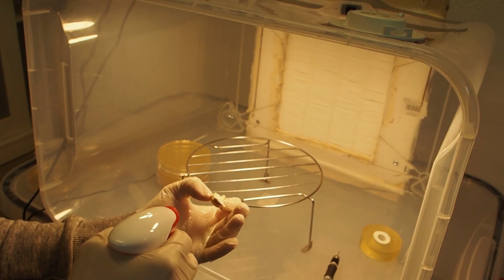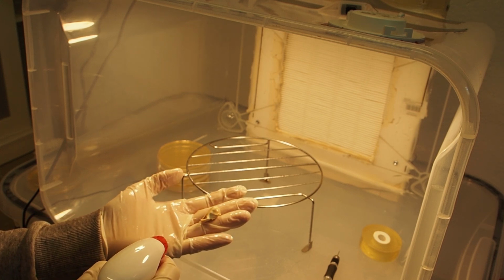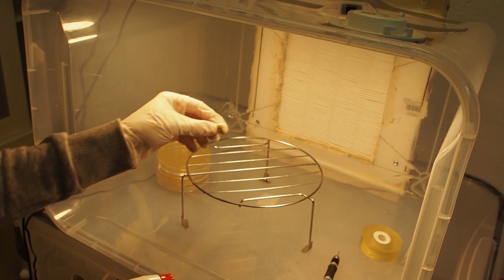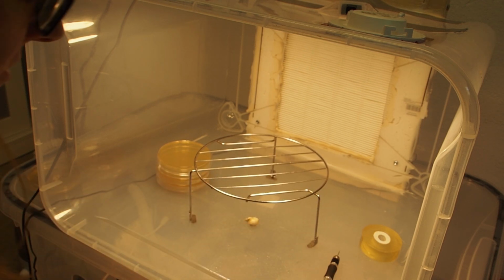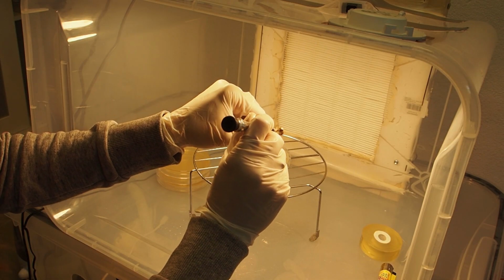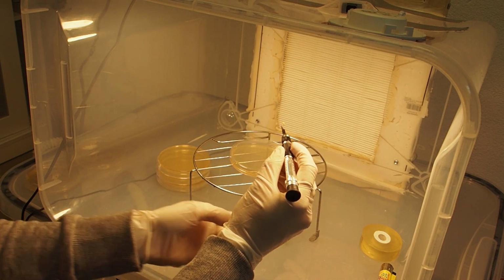Alright, so next here I have a piece of reishi that I just cut off from my reishi culture. And now I'm going to dissect this and I will cut out one piece in the middle. Okay, I got one good piece.